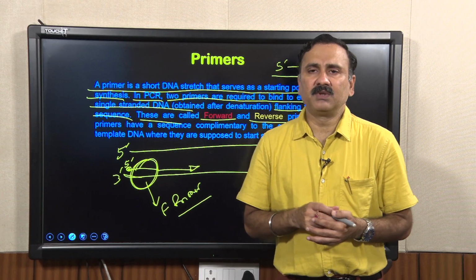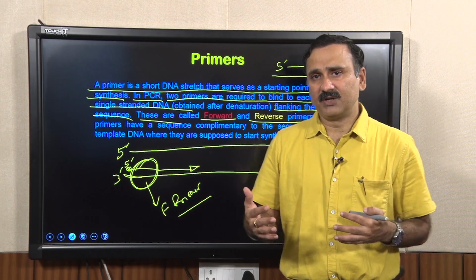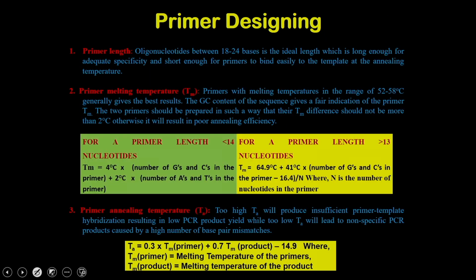Now the question comes: how can you design the forward as well as the reverse primers? Before you design the primers, you have to consider many parameters.